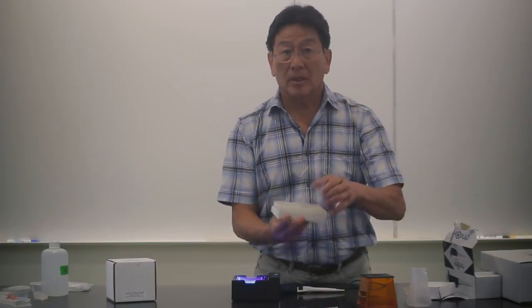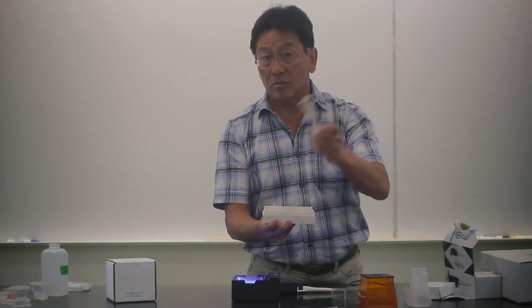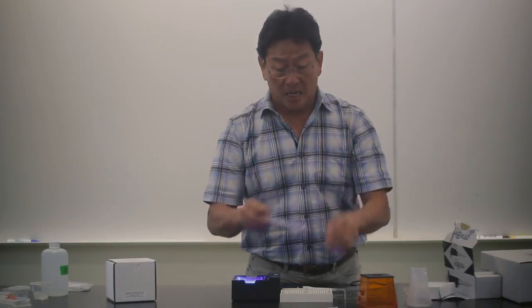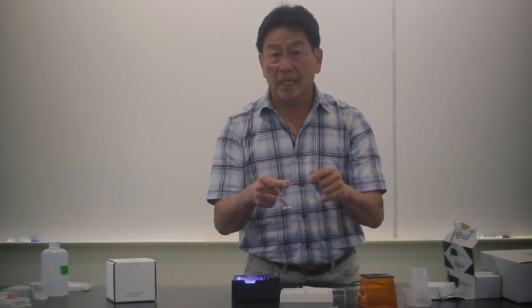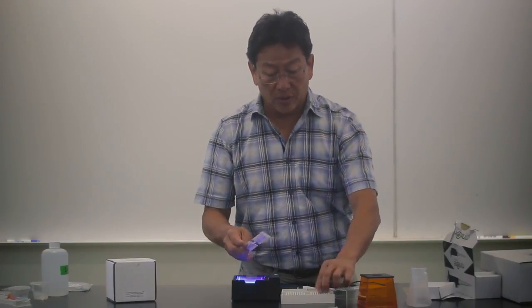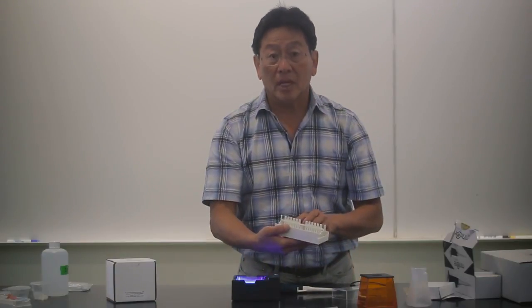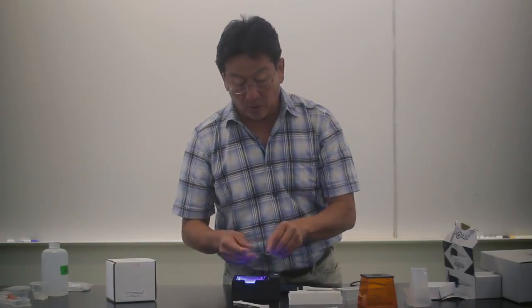The casting system essentially has a little bento box with trays inside and combs. The combs let you run six or nine wells. These gels are the most efficient in terms of length as well as the time it takes to run. When you make the gels, all you have to do is take the combs — there's only one way to put them in — place them in and choose the wells you want. It takes about 10 minutes to set. Once set, you take the gels out and insert them into the unit with the wells.